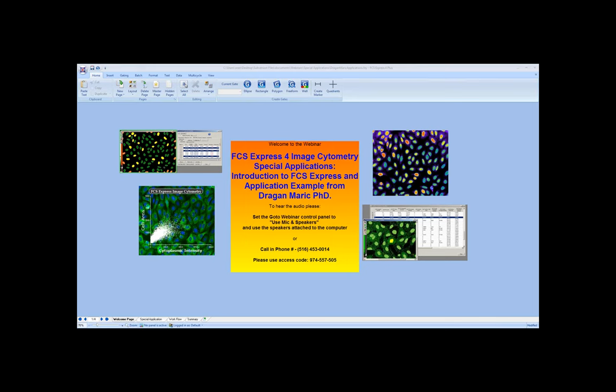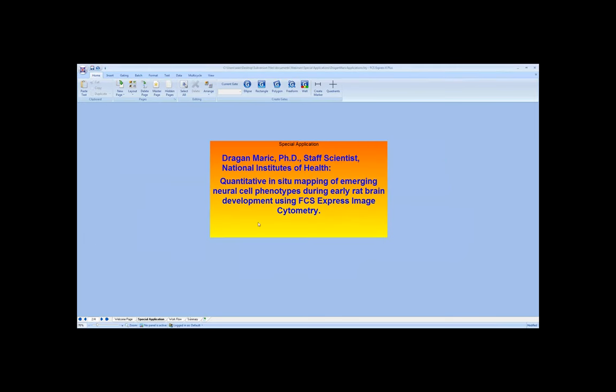So I think we have a very exciting webinar scheduled for today. Today we're going to be discussing FCS Express 4 Image Cytometry, and we're also going to be showing some special applications from Dragan Maric. Dragan Maric is a staff scientist at the National Institutes of Health, and later on during the webinar, in maybe about 20 minutes, he's going to be talking about his quantitative in situ mapping of emerging neural cell phenotypes during early rat brain development, using FCS Express Image Cytometry to generate some of these results.